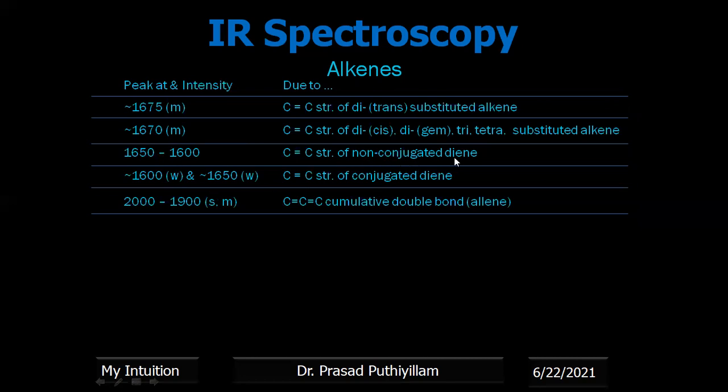If it is a non-conjugated diene, then we expect around 1650 to 1600. In that range also, one peak is expected if it is a non-conjugated diene. Most of the dienes are non-conjugated. If it is a conjugated case, with alternate single and double bonds, the conjugation also we explained, it will give two different peaks, at least around 1600 to 1650.